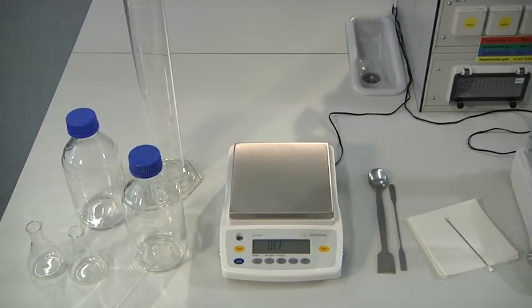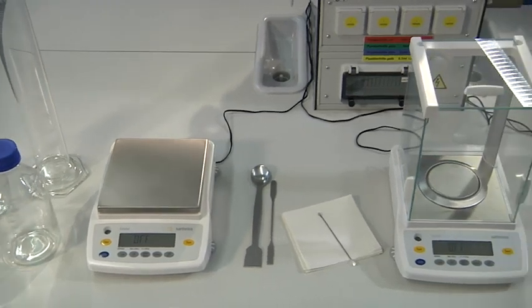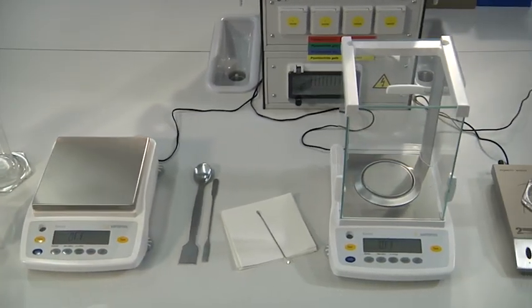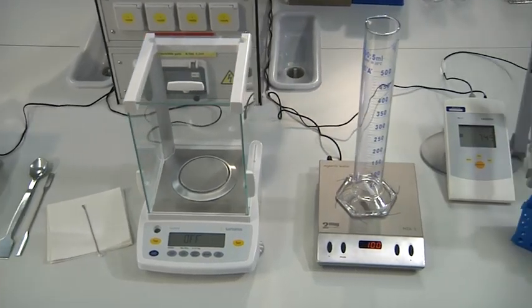For medium preparation, a graduated cylinder, an autoclavable bottle, a scale with 0.01 gram readability, and an analytical balance with 0.1 milligram readability are required.